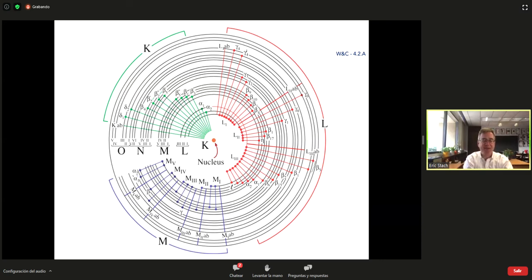And again, really all you need to know is about EDS. I've got 2 lectures on inelastic scattering and EDS. There's another 2 lectures on EELS, 3 lectures on STEM and the like. So I just wanted to offer that as a follow-up for you to learn more.